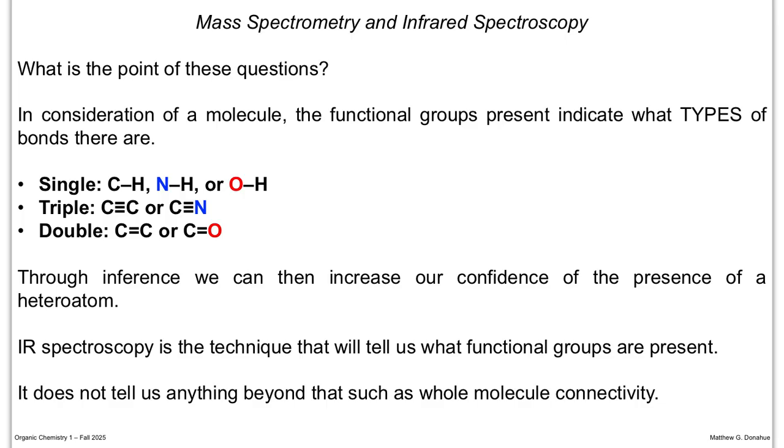Anything below 1,500, we're not going to study, because these are the main bonding patterns in those functional groups. So when you're looking at IR, you look to these regions: do you see the presence of a signal that will confirm the functional group? Then you can say, yeah, this is a fragment in there. If it's not there, then don't propose it, because it's not being supported by the data.